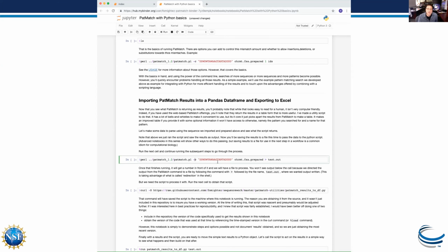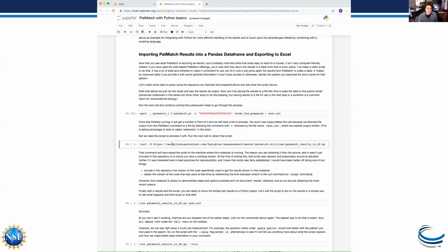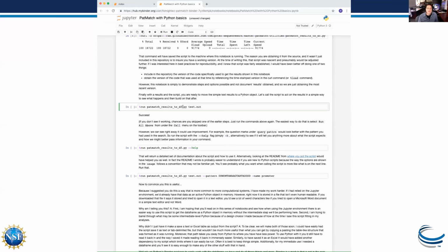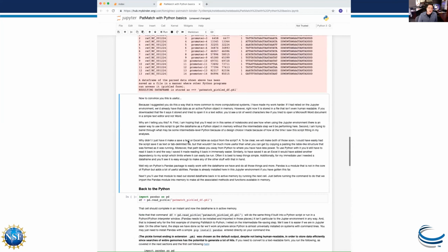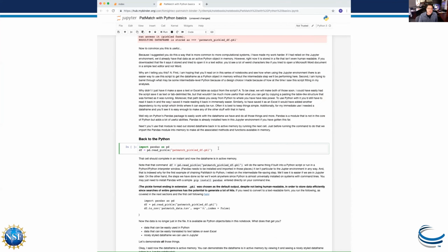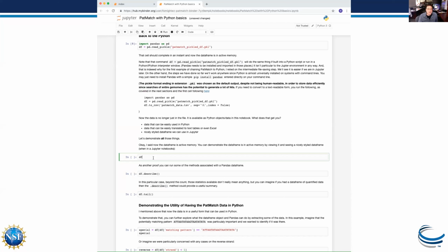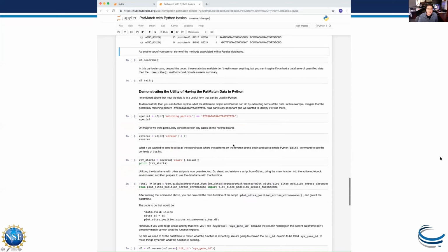So what we're going to do here is save it as a file instead of just printing that text to the screen, by running that cell. Then we're going to get a script that allows us to bring it into a data frame, which, you might have heard before, is a way to handle large amounts of data, kind of like a spreadsheet, but much better and much more powerful. So we're going to run this one where we give it some additional options that help make things a little clearer later. Now we see that we did that. We're going to bring it in, because it saved it as a file. For now, we're doing it the kind of long way. When we run this, we see the data frame and we get this nice format, much clearer than that text we had before.